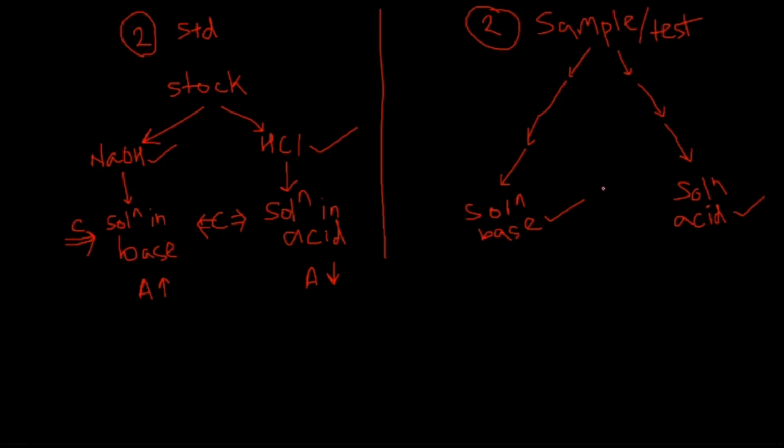When we are diluting, we will take care that their concentration is not only same, okay, but it will also match concentration that of the standard. Okay, it will be theoretical dilution, because we don't know actual concentration. ये हम predict करेंगे कि हाँ अभी ये ऐसा dilution किया तो दोनों का concentration standard और test का similar होगा. Okay, so I hope you are clear till here. Okay, so similarly हम absorbance लेंगे test का, which is the solution prepared in basic condition. It will have larger absorbance as compared to solution prepared in the acidic medium.